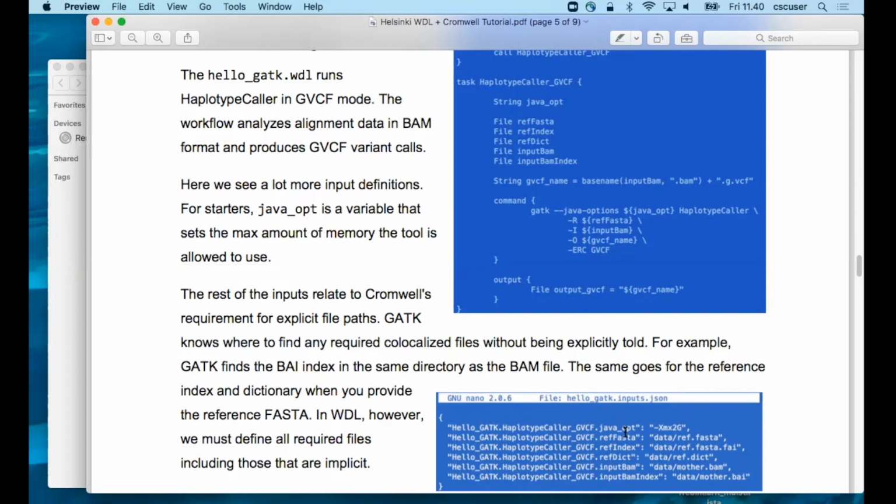The question is whether you manually enter these values or whether there is an automated way of entering them. Yes, you'll need to put these values in. You could script this. You could make a script that generates a populated JSON, so you can automate that, but we don't provide the tool, and Womtool won't do that.